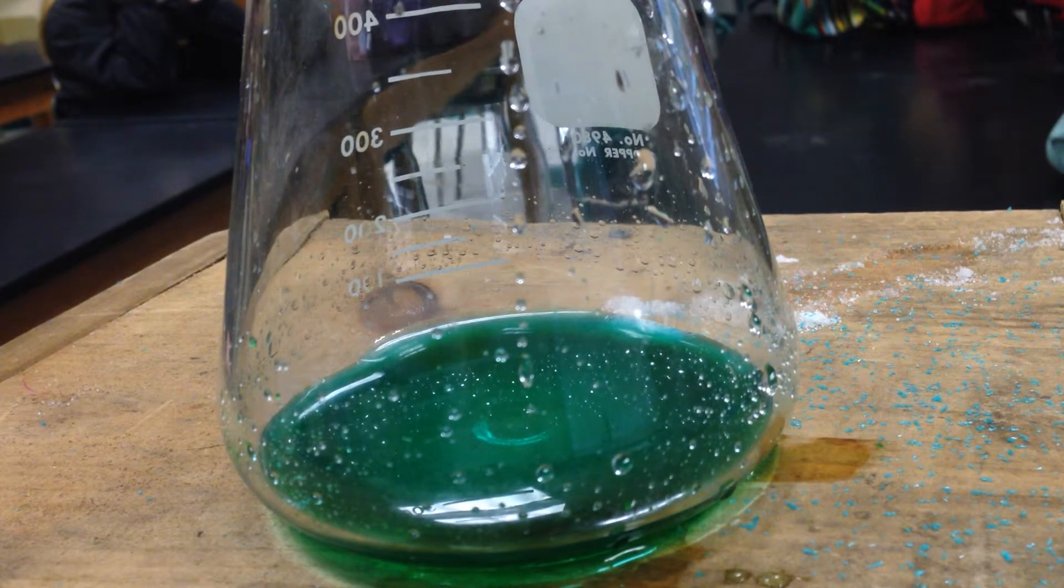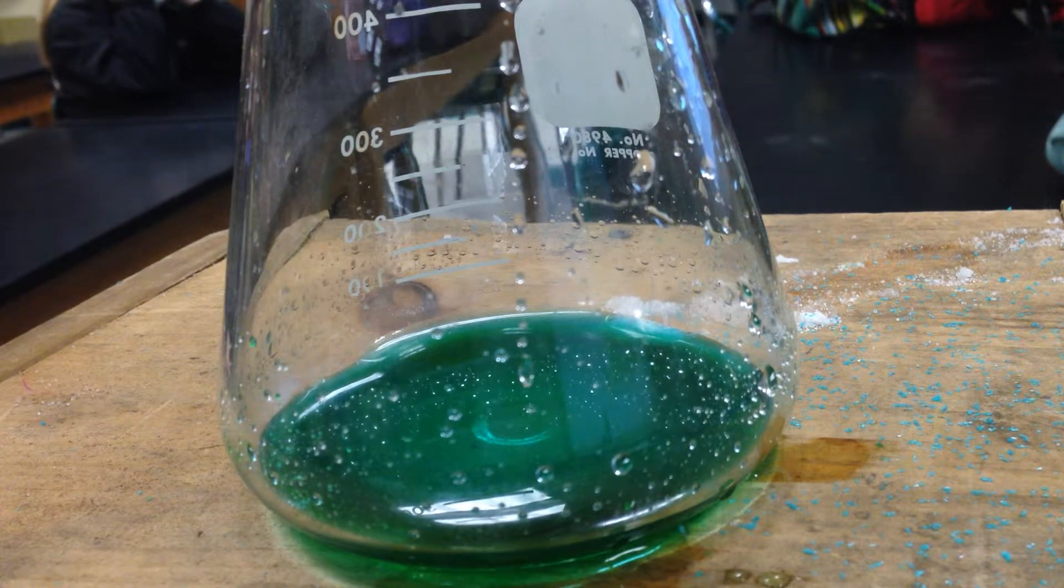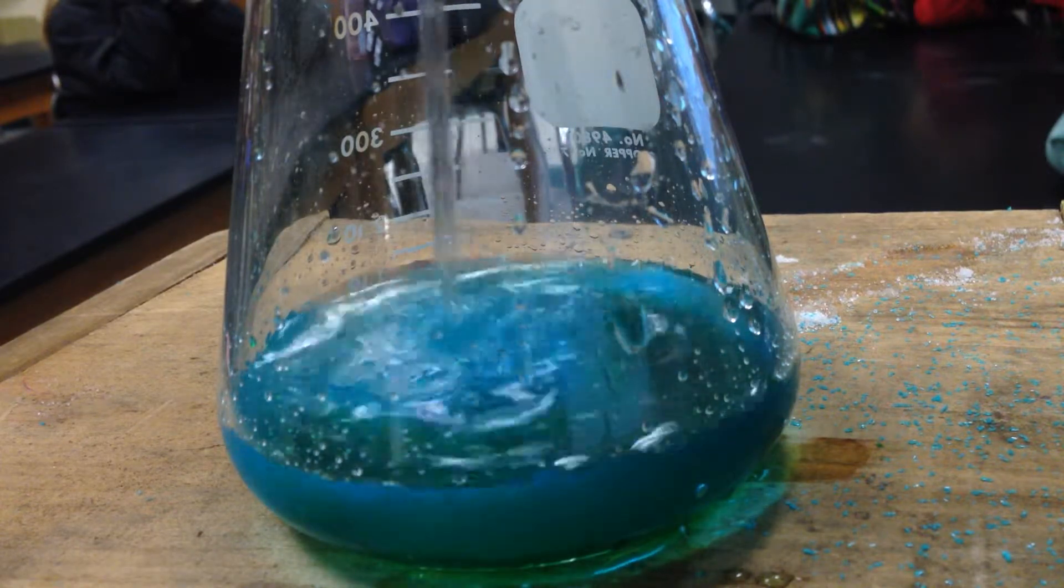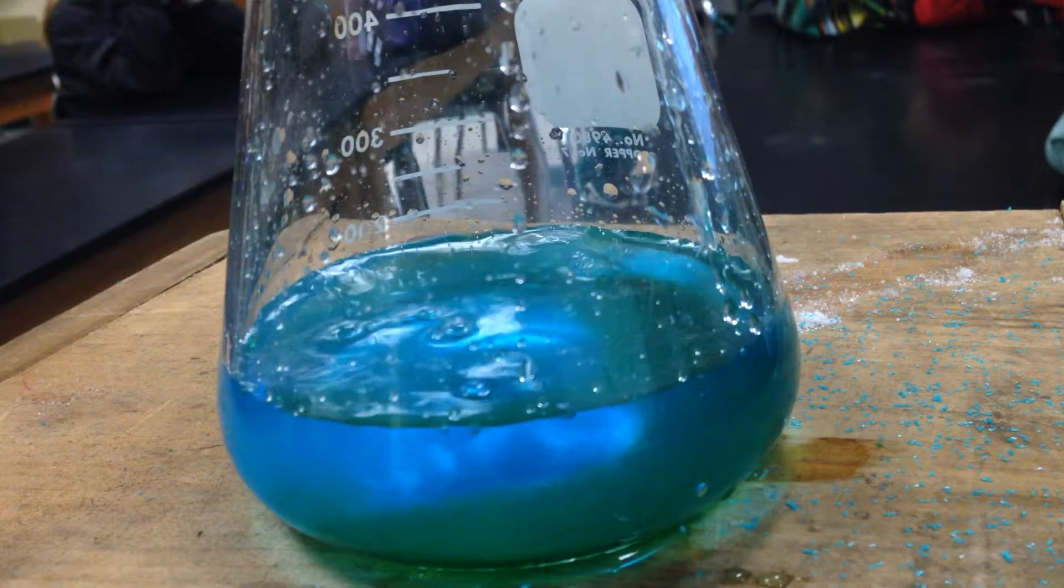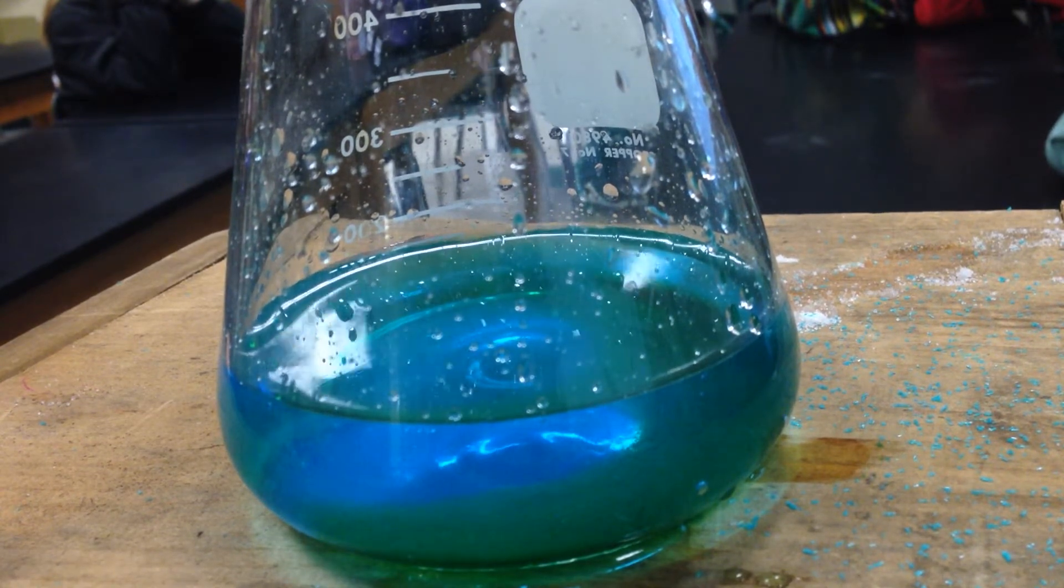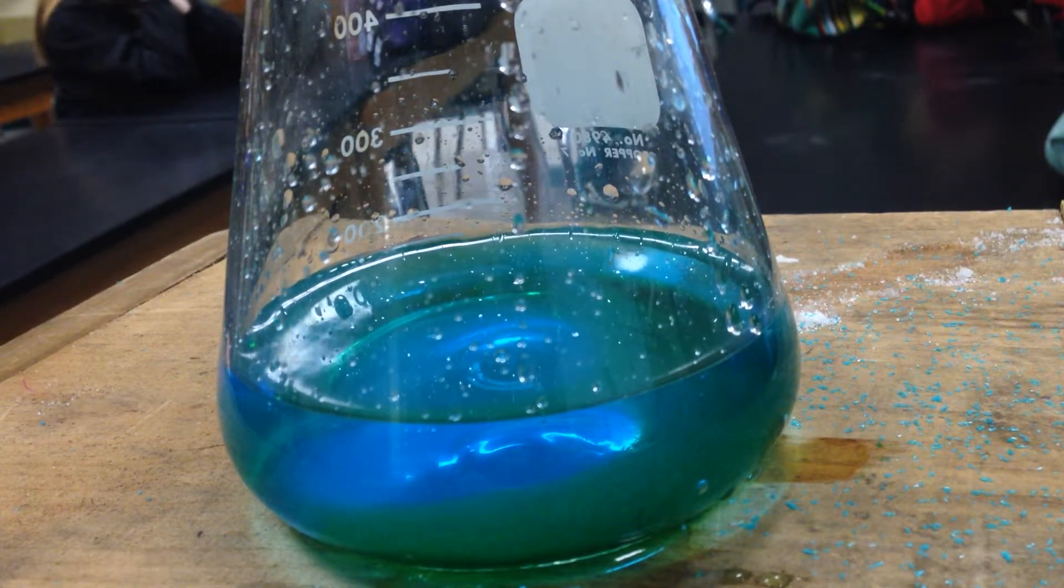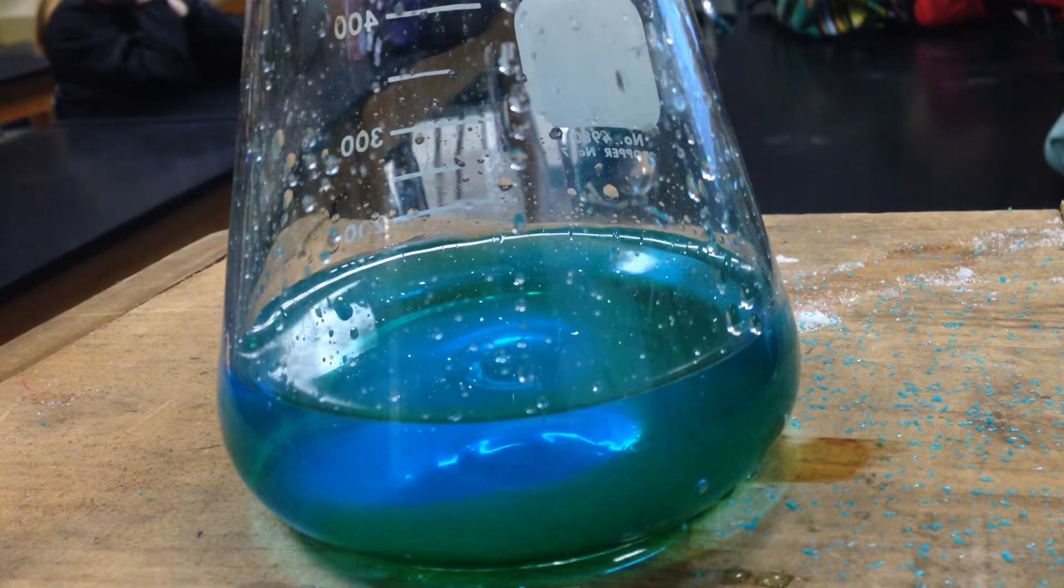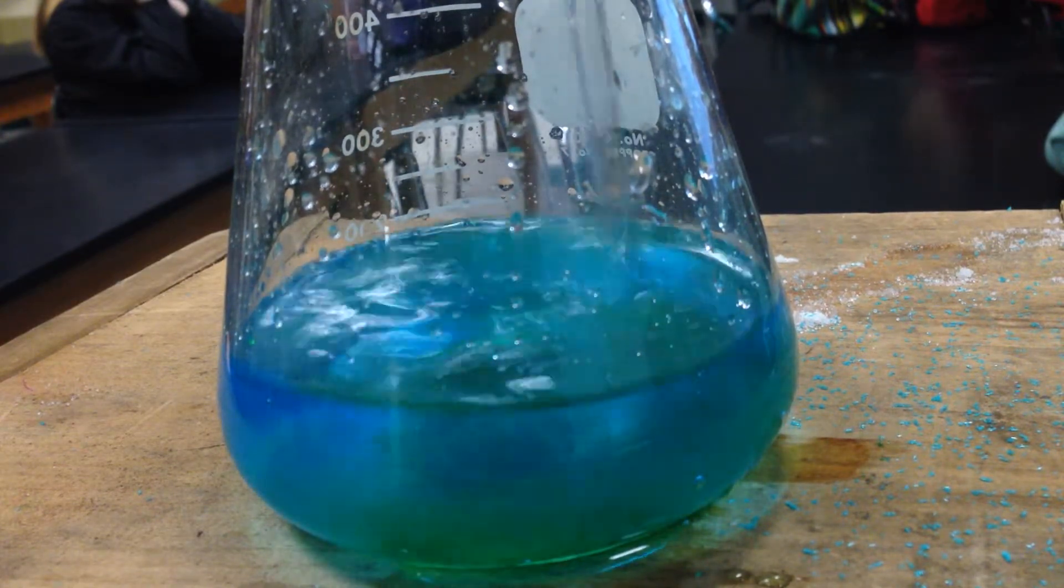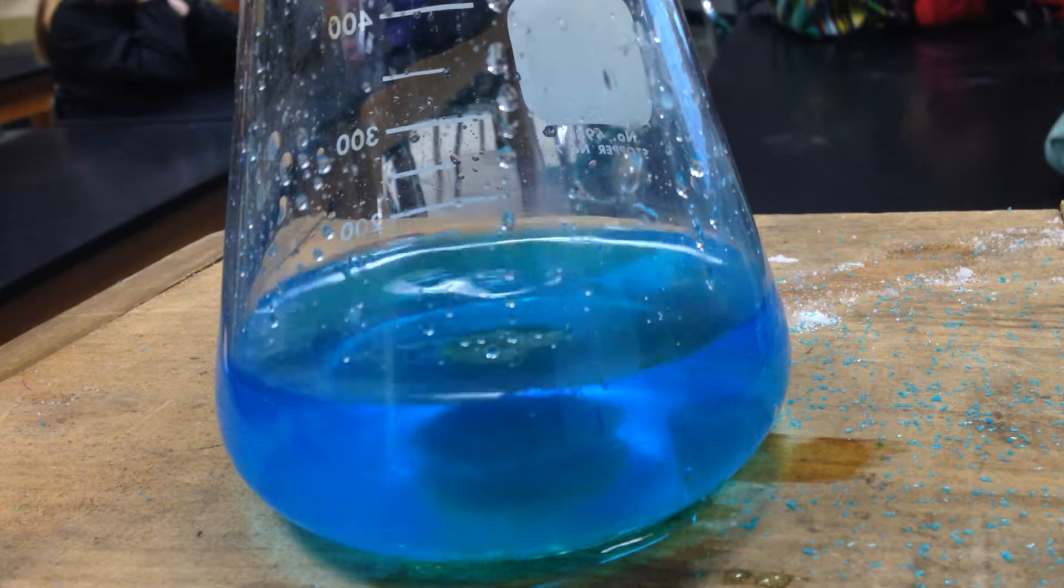But now as I pour more water, what happens to my color? Why is there a color change? Because now I have water being the predominant ligand onto the copper, and by changing the ligand, I change the amount of splitting. So this is going from green to blue, so what's happening, actually, is probably the gap is getting smaller to give off this retransmission of these photons. So by adding more water, I made the color change. So we're getting back to the original color of the hydrate, right?